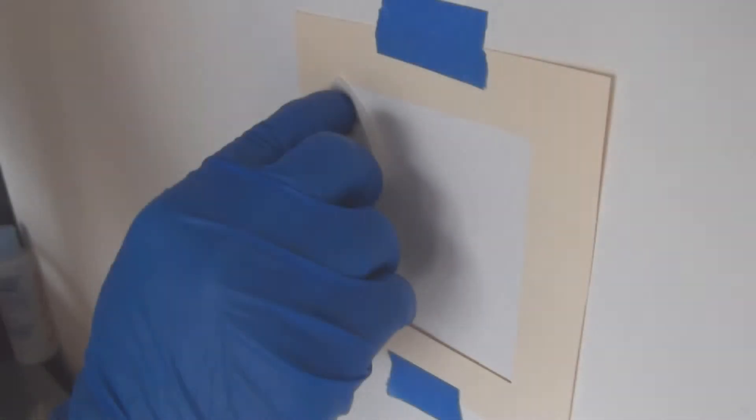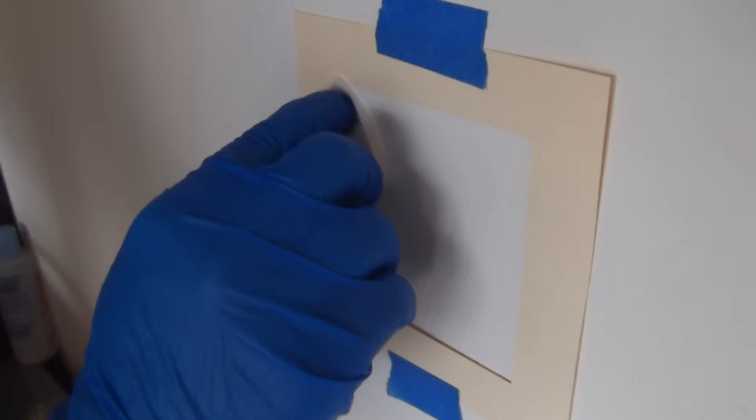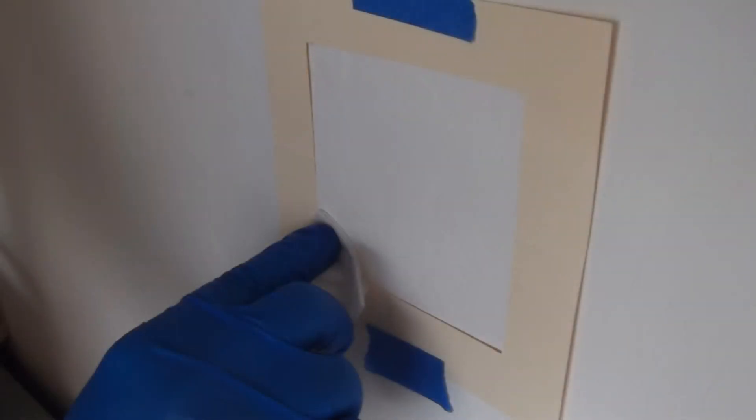Using the fresh surface of the wipe again, wipe or blot the same area at a 90-degree angle to the previous wipe pattern.